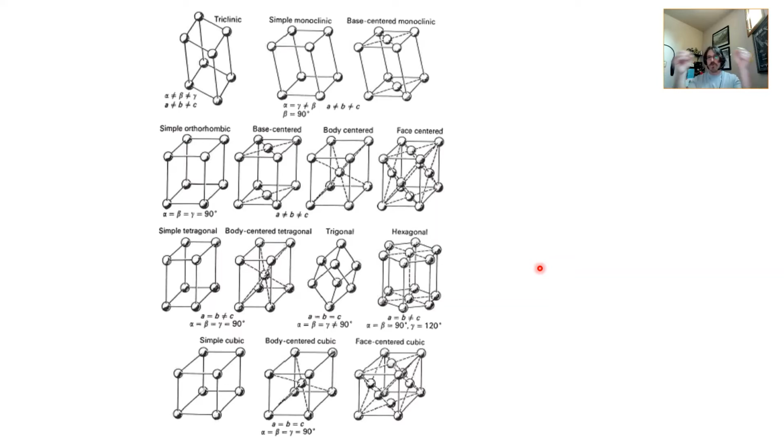Okay, so these equilibrium points from a simple model of atom A meeting up with atom B of the same substance, finding this equilibrium point on a greater scale gives us one of these unit cells, and on an even greater scale gives us a repeating unit structure, or crystal structure, excuse me, allows us to analyze this material via X-ray diffraction. Very interesting stuff.